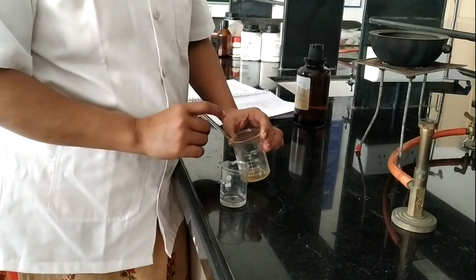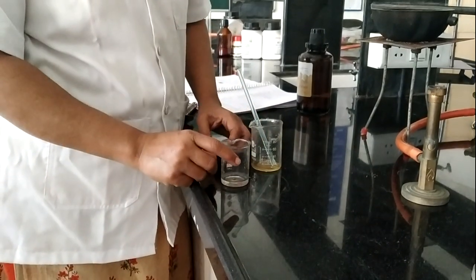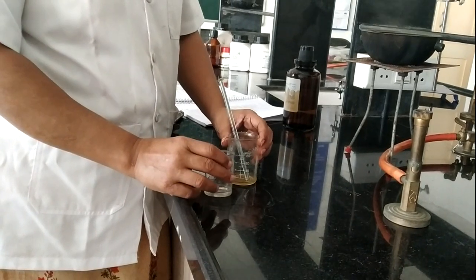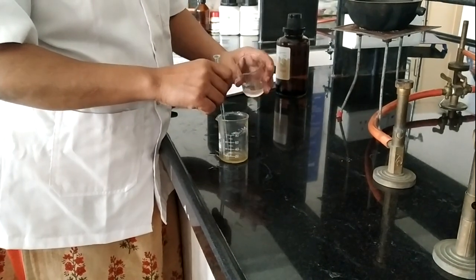These are the two beakers: in the first beaker stearic acid and lanolin we melted, and in the second beaker glycerin, triethanolamine and water are added. After that we added these two liquids into one another by continuous stirring.